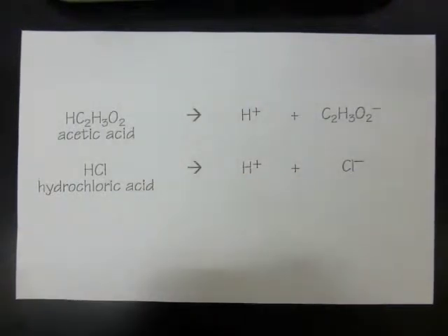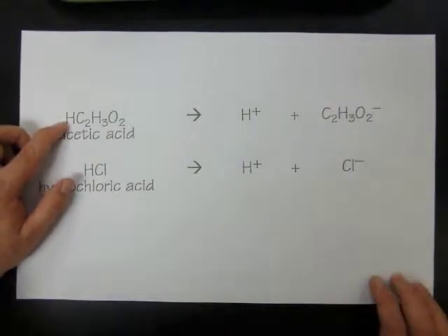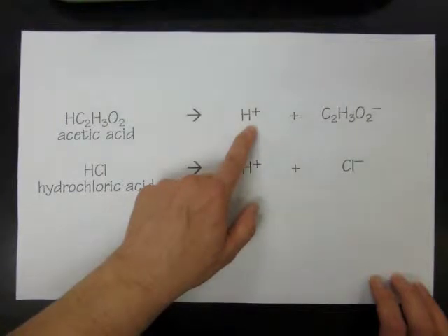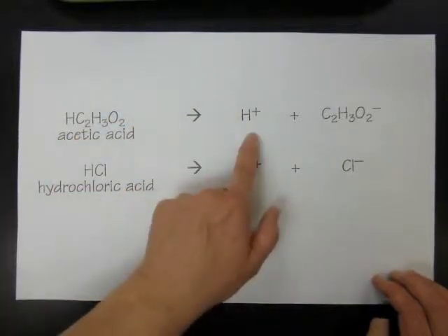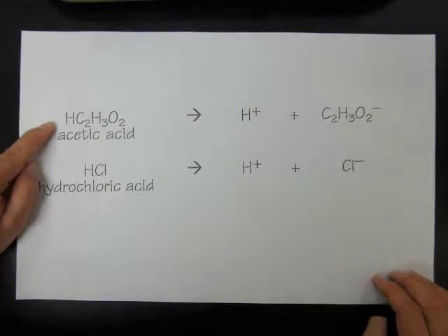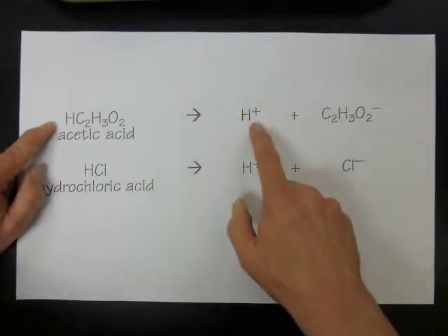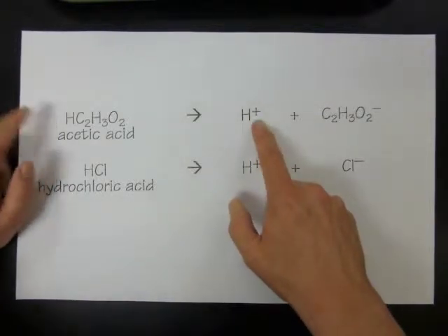Now, when you look at the amount of acid that you have in a solution, we can measure how much it dissociates by measuring the hydrogen ion concentration in the solution using a pH meter. What we're going to try to find out in this experiment is how much of the dissociation reaction actually occurs. For every one acid molecule in this balanced reaction equation, if it dissociates, I should make one proton. If I had two of these, then I would make two protons, and so on.